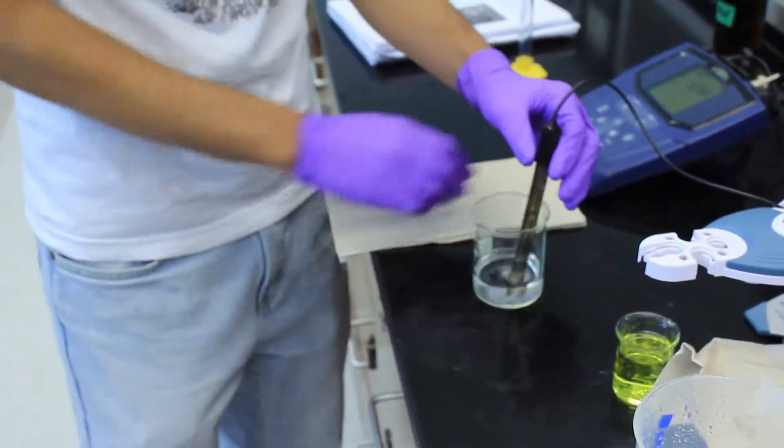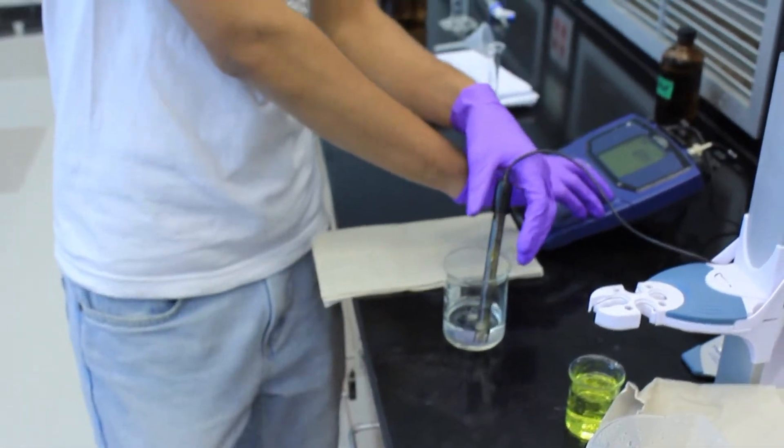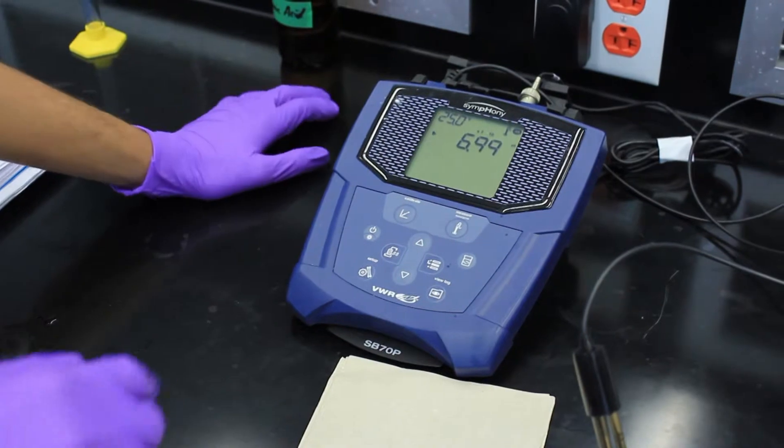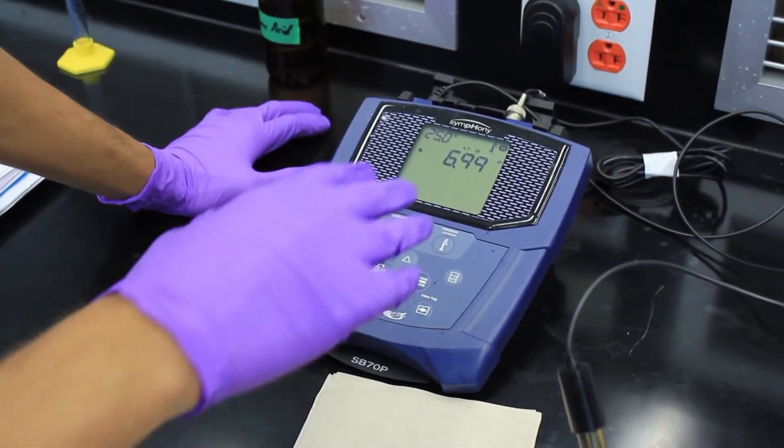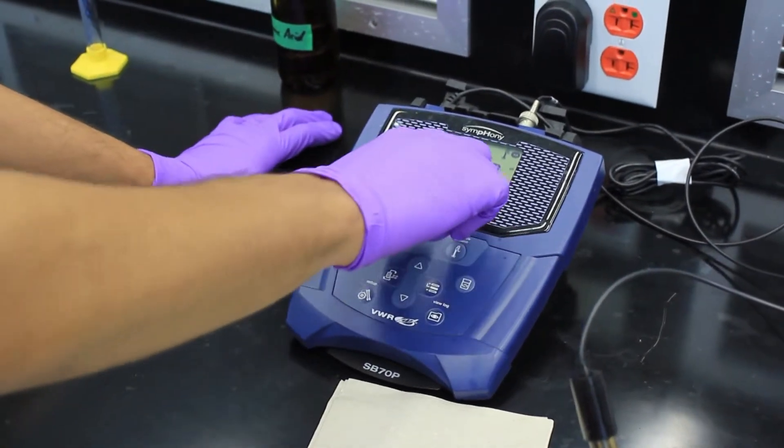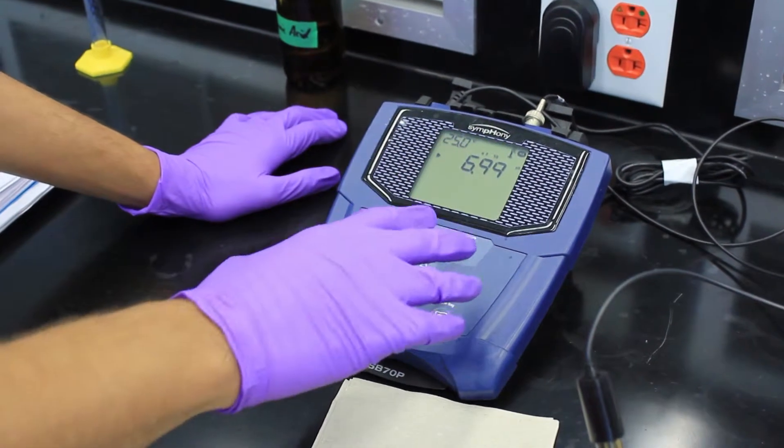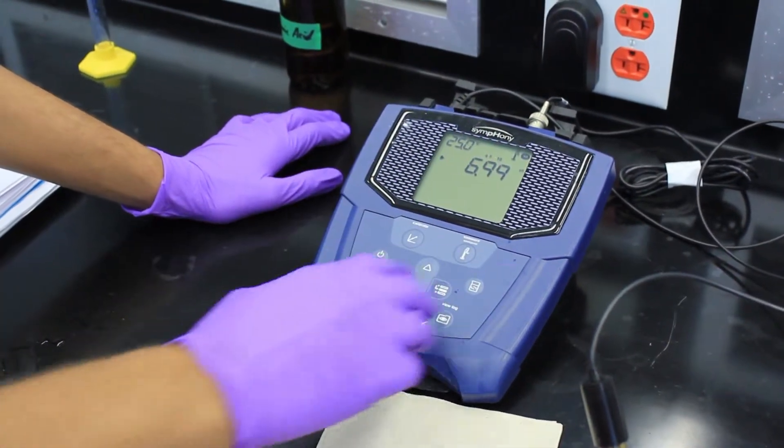Insert it into your solution. The way the Symphony pH meter works is that it's already calibrated, so whenever 4, 7, and 10 show up right above the pH, that means it's calibrated.